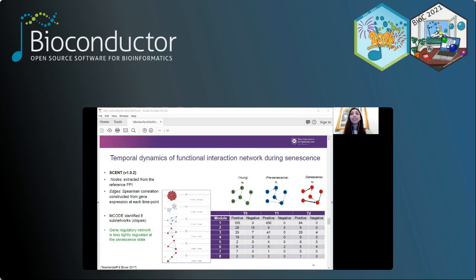One of the main challenges in single-cell RNA-seq data is sparsity, meaning there are a lot of zeros. Because of this issue, it is quite challenging to construct any type of correlation. There is a lot of literature out there proposing different strategies, but I haven't really found any good method that was useful, at least for this data set. So please let me know if you have any recommendations.